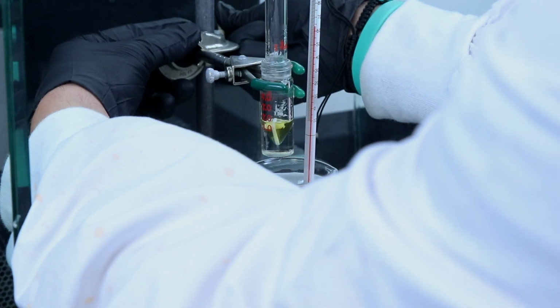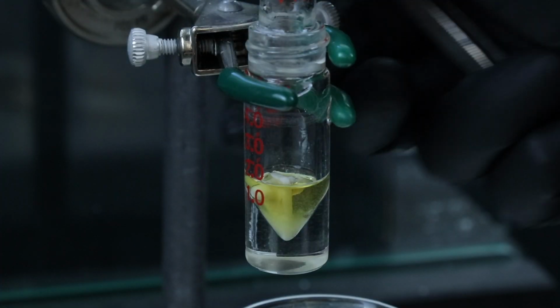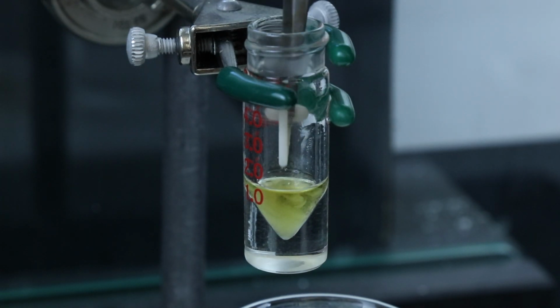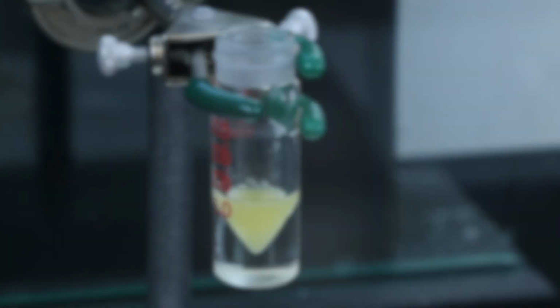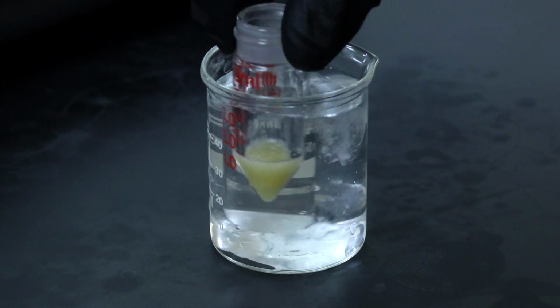Once the 90 minutes have passed, I'll take the conical vial out of the hot water bath and remove the spin vane. And here you can already see some of the solid coming out of solution, but we'll let it stand there for a little while just to make sure that the product does crystallize out of solution really well. I'll even dip it in an ice bath to make sure that that process is complete.